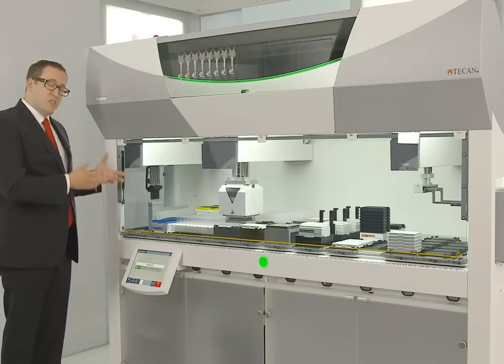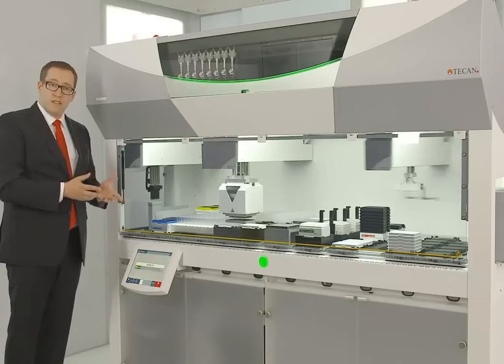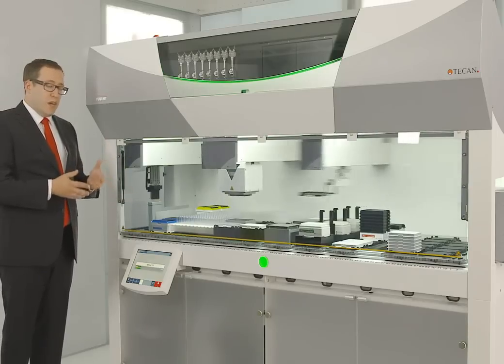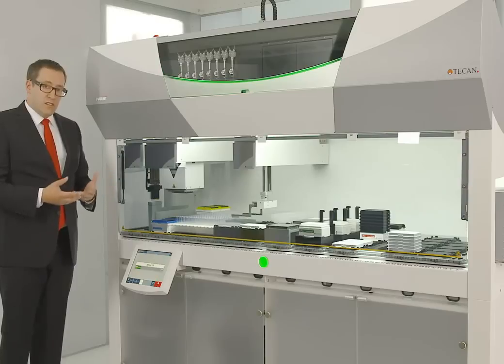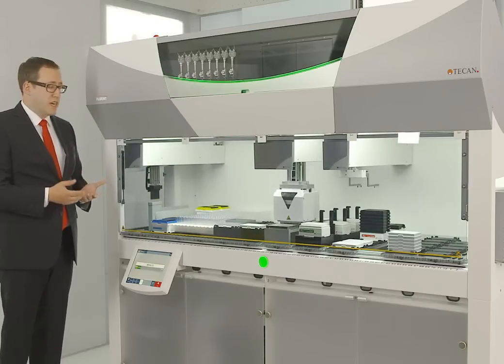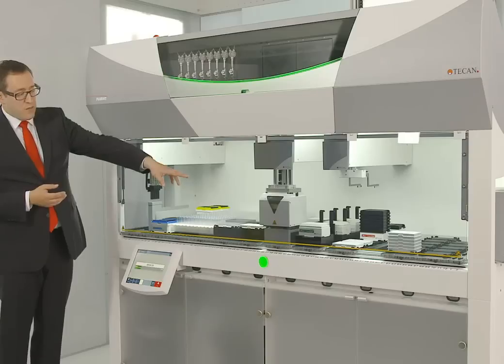Well, the hardware delivers such a high degree of mechanical accuracy and precision that we can actually go to any spot on the work table once the instrument has been installed and set up correctly. We don't have to check any of those positions ahead of time. This move here is one of my favorites.